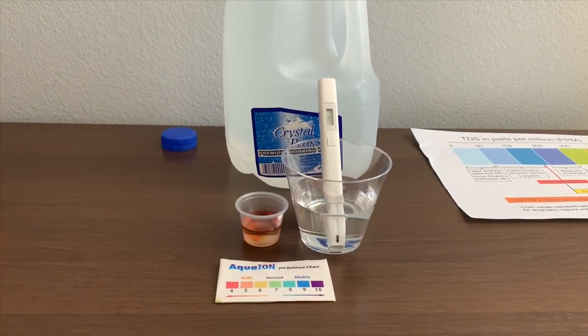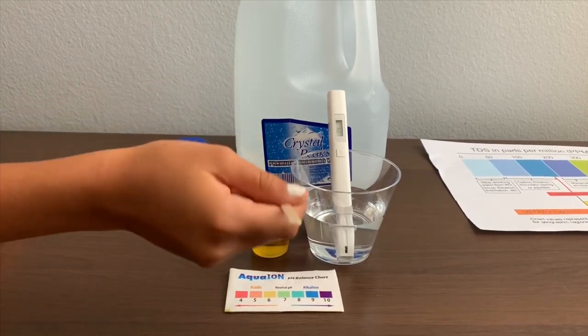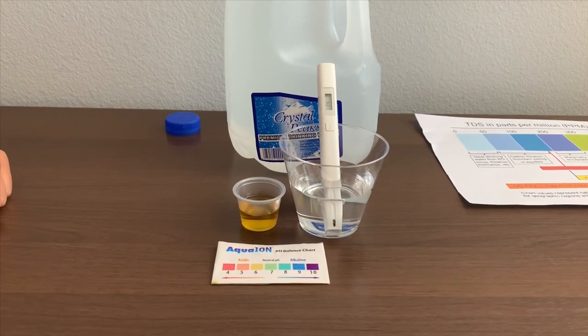Let it sit for a better result. I'd say that's a six — that is acidic.